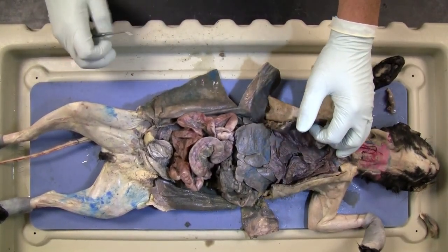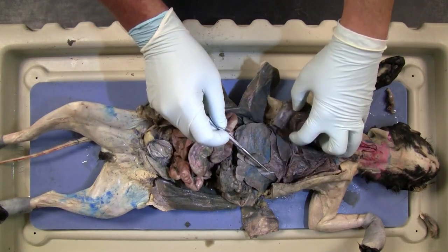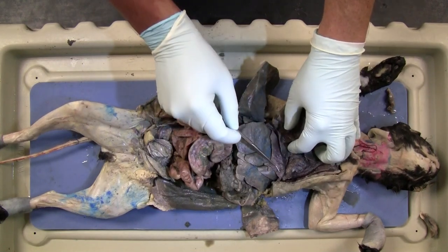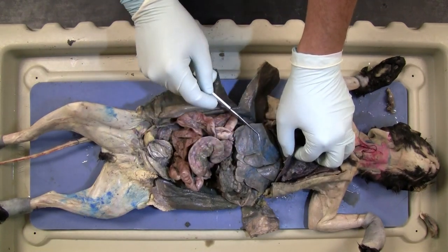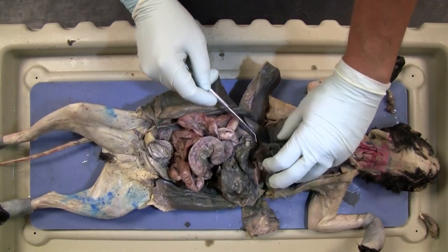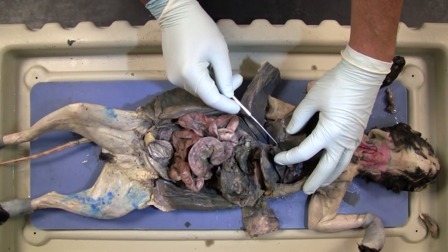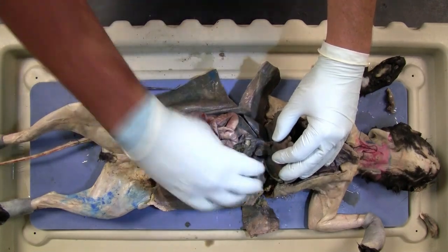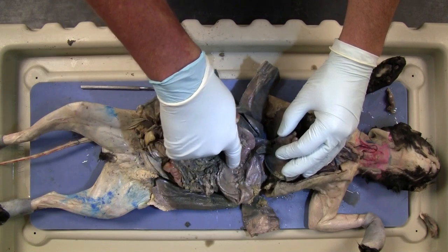When you're starting with the digestive system, always look for the landmarks first. So you start up here, you can see the diaphragm. Underneath the diaphragm, you can see the liver. Right underneath the liver, you'll be able to pick out the gallbladder. And then underneath the liver, you'll be able to make out the stomach.